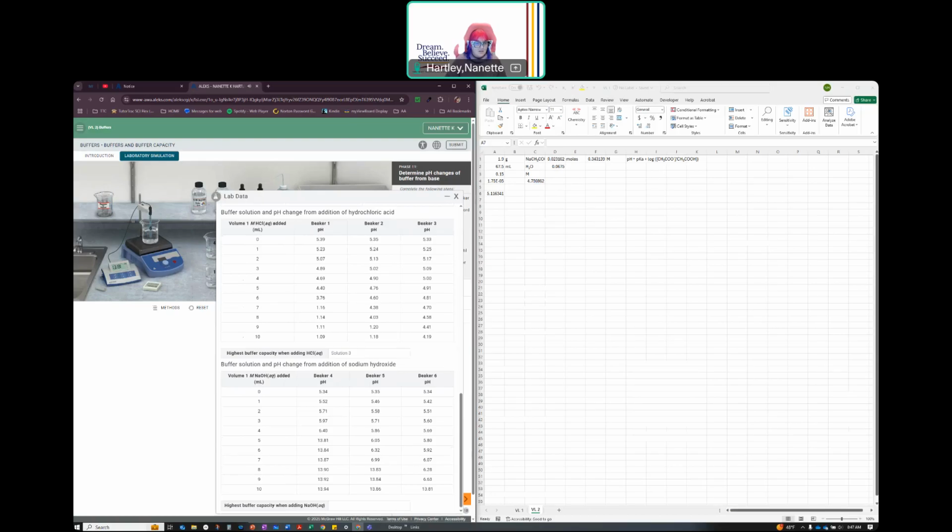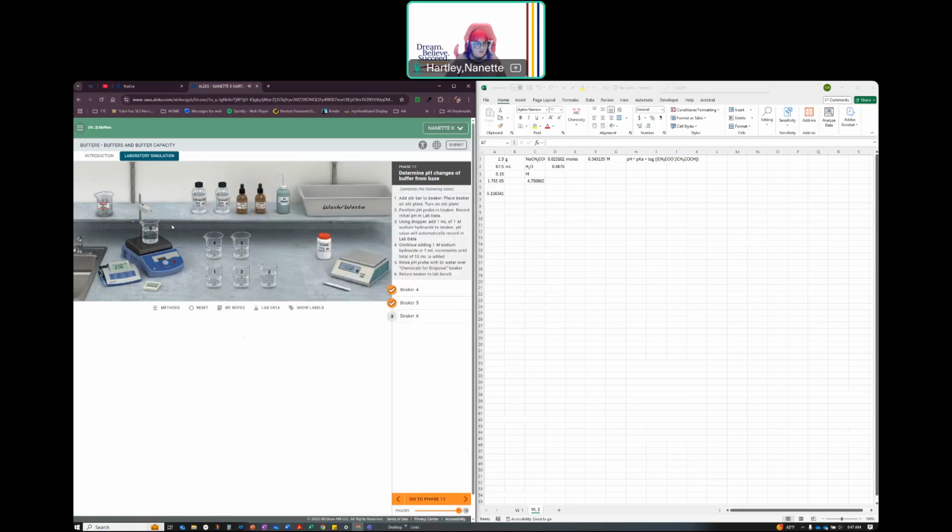Back. Out. Take this to clean it. Find this down. Closing this up. Taking this off. And going to the next phase.